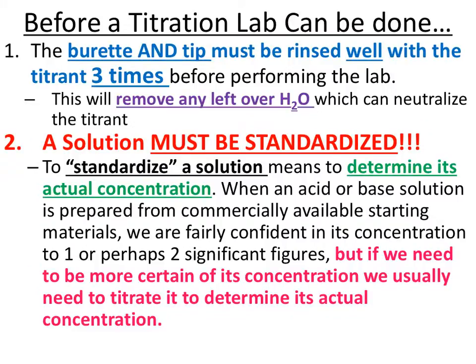So before the titration lab can be done, these are some things that must be done. Here's why I'm sharing this with you. Let's pretend that you get a question: we want to run a titration, set the lab up for me. These are some things you would have to include in that explanation of how you would do the lab. The first thing you'd have to do is take the burette and rinse it 3 times.